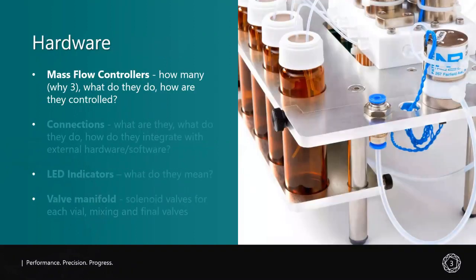Before we get into setting up the system and using it, we first need to go over what components make up the Olfactometer and what role they play. One of the most important parts of the system are the mass flow controllers. I'll talk about why there are three, what they do, and how they are controlled.